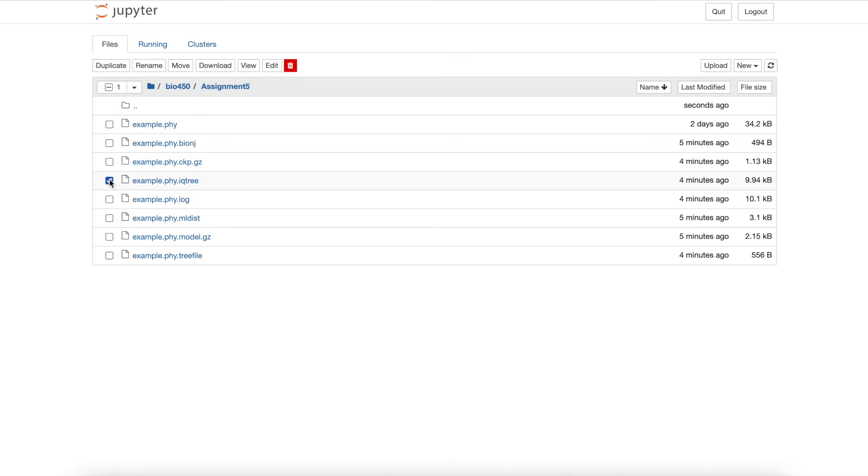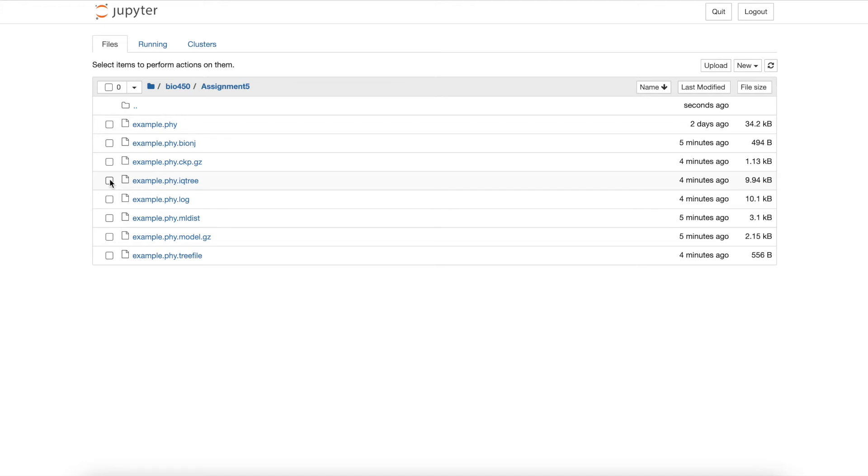This file, example.phy.iqtree, is the main report file. It is self-readable, meaning you don't have to use any other programs to interpret it, and shows a textual representation of the final phylogenetic tree.